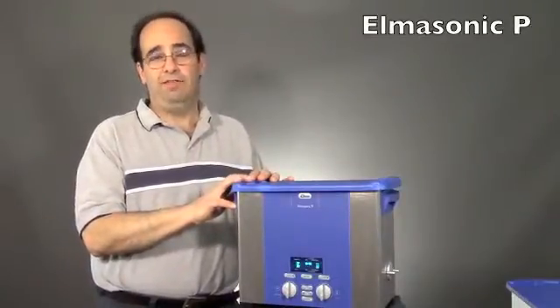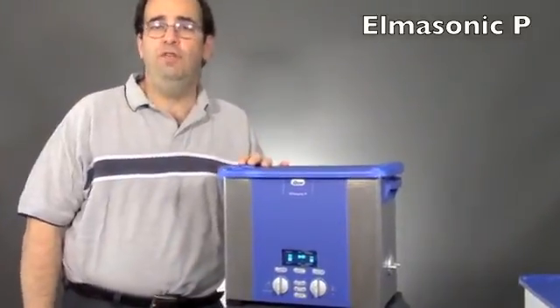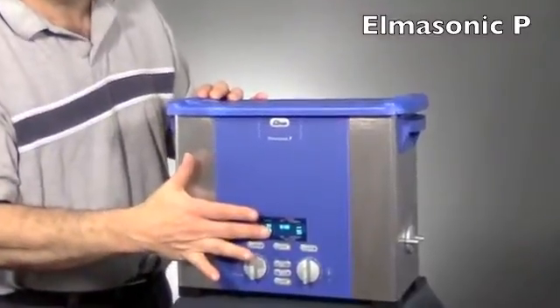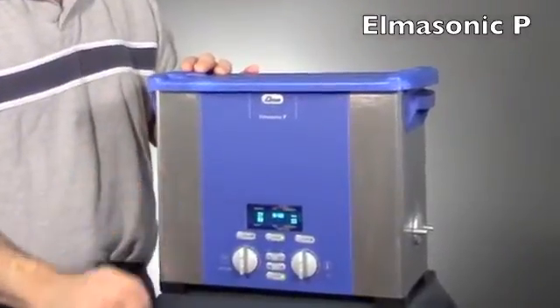The P units are our most advanced product. You get all the features of the S line, plus a whole lot more power, and also this really nice digital display. You know exactly what's going on at every minute.